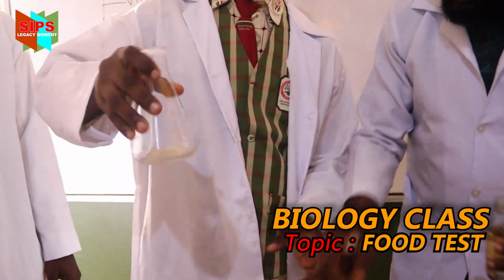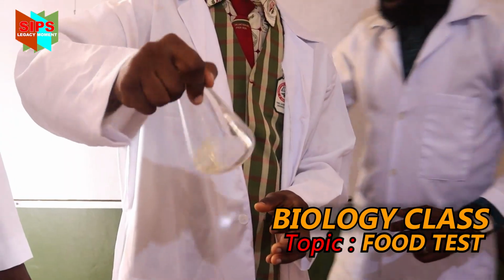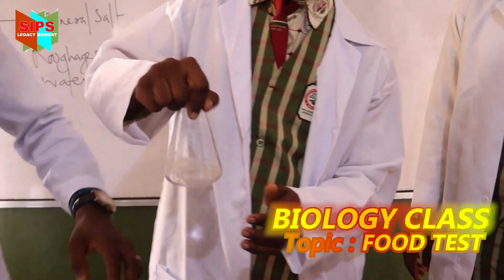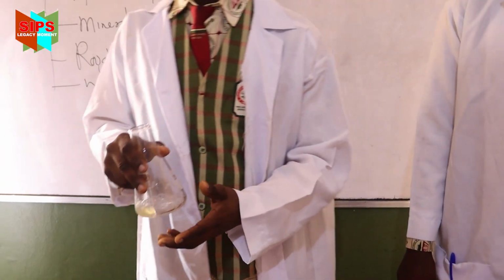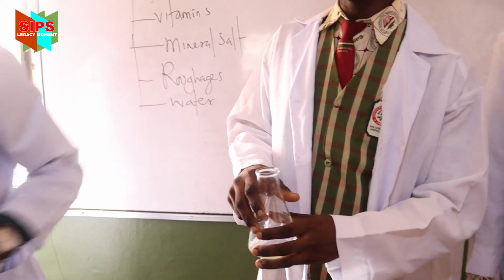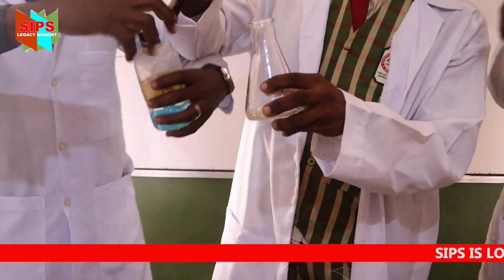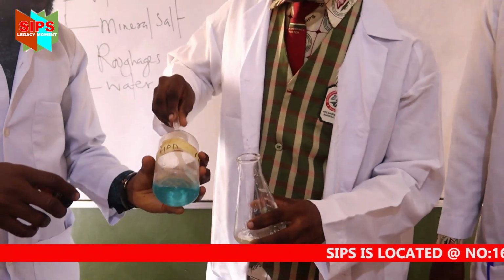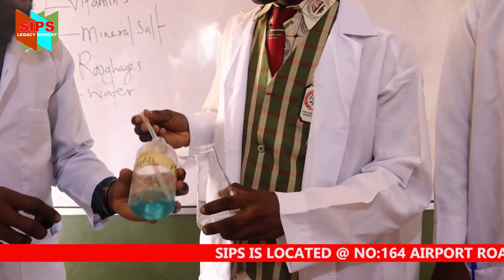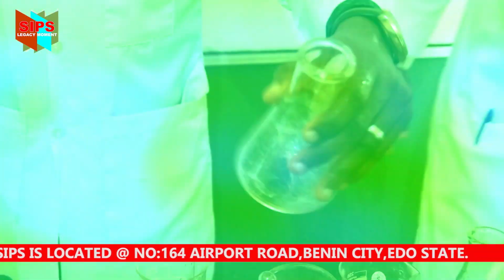Shake it. Now, after you add sodium hydroxide, the next thing we have to add is what we call the CuSO4. What did I call it? CuSO4. So add to it. Add your CuSO4 to it. Now please understand what's going to happen. Add and shake.